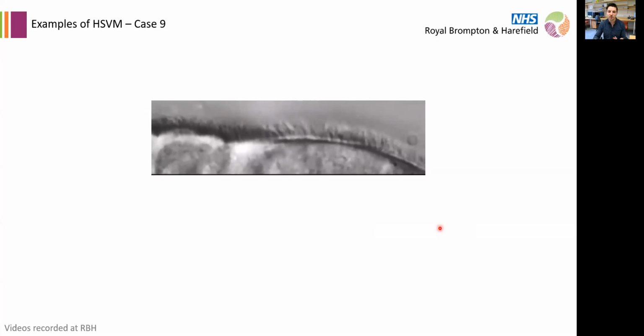The beating is somewhat normal, but it seems to have a really long pause and then kind of rush into its forward motion. And so this patient is a CCDC164 DRC1, which is a dynein regulatory complex. And so TEM showed microtubular disorganization, and it's kind of subtle, and it can be associated with nexin link.